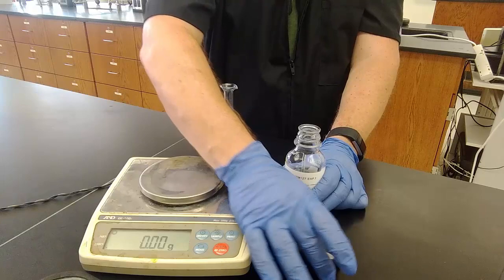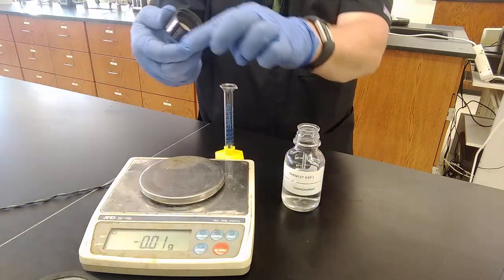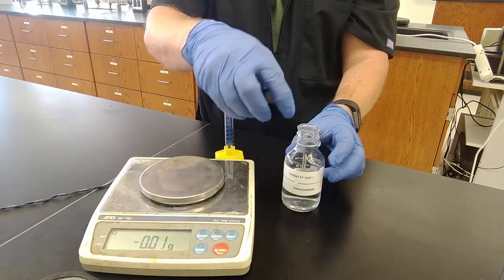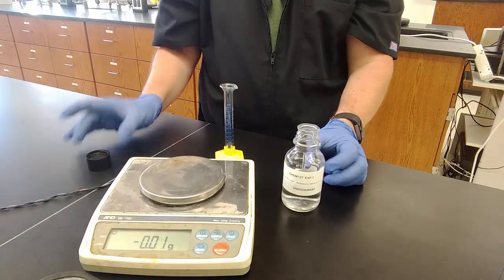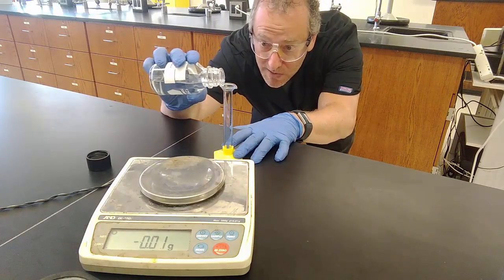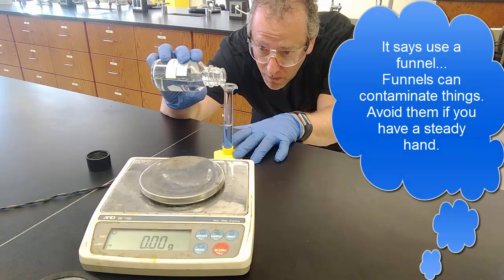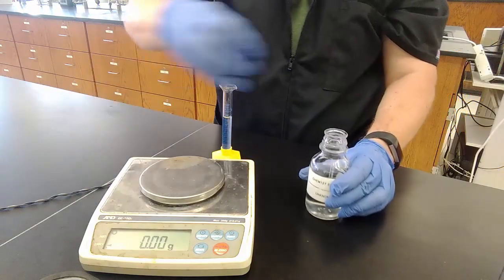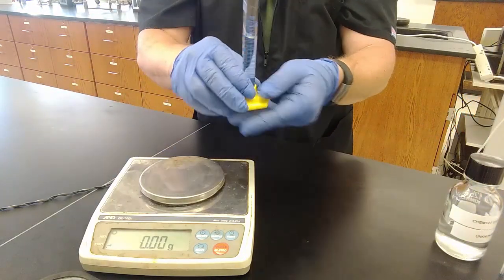So I'm going to put my cap down, cap up. If you put it like this, then you can get stuff contaminating the lip, and when you put it back on the jar, maybe it goes in the jar or just contaminates the bottle. So I always put my cap up. Again, I get down around eye level, and I pour somewhere between 8 and 10 milliliters in there. And there we go, between 8 and 10. Put my cap back on so it doesn't evaporate or anything fall into it.